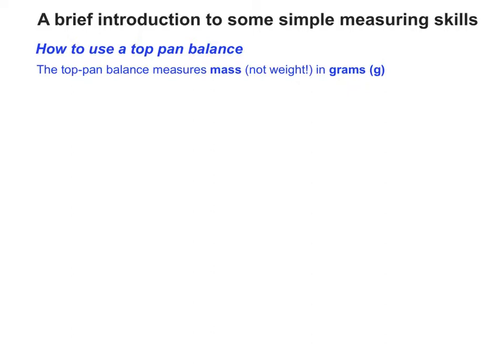Before we start showing you how to use a top pan balance, it's important to point out that it actually measures mass, not weight, and the unit of mass that we use is grams.